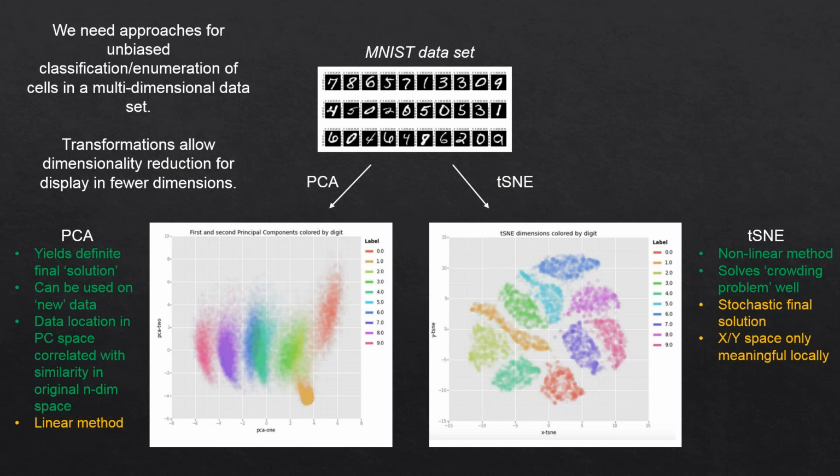And many of you, I'm sure, have seen either PCA or tSNE used in other situations, whether it's with CyTOF data or even single-cell RNA-seq data, any case where you have a large number of parameters by some number of samples. This is just an illustration of how tSNE can sometimes perform better than PCA in terms of resolving unique populations. It really just depends on the shape of the underlying data how well it works. But I think this is a really nice example that shows that tSNE can be superior, at least in resolving different discrete populations from a high dimensionality data set.